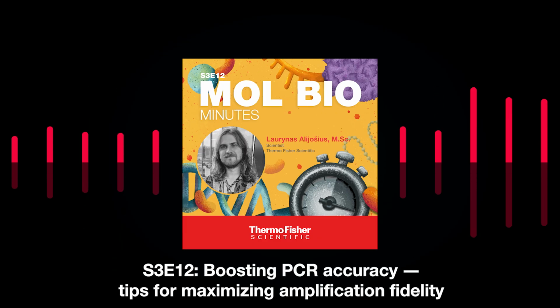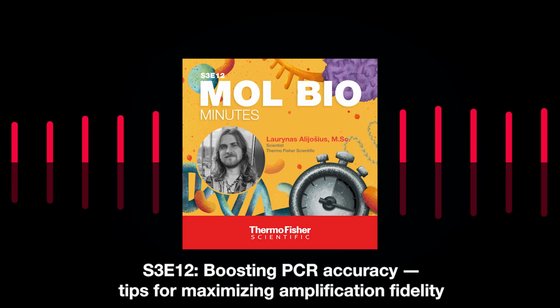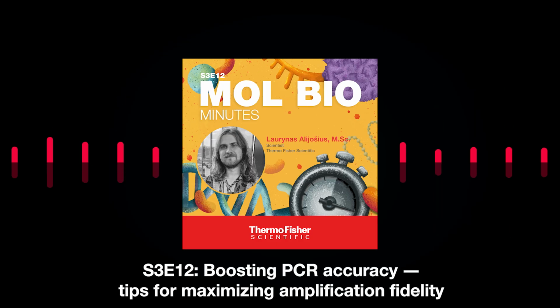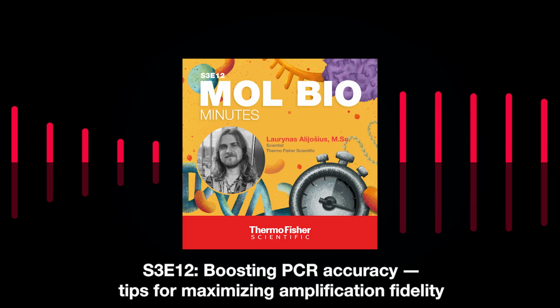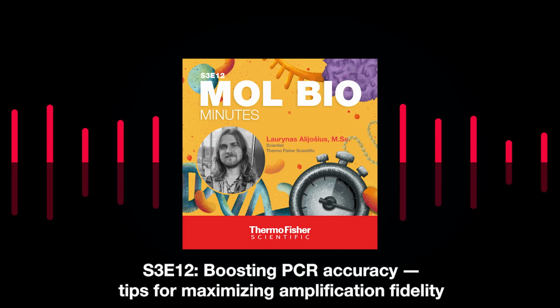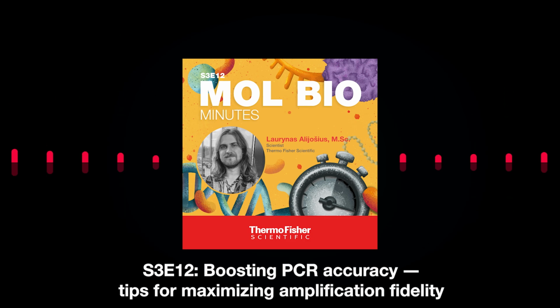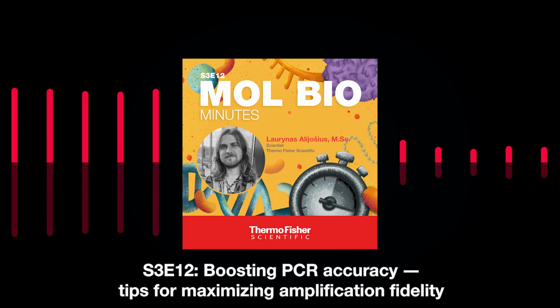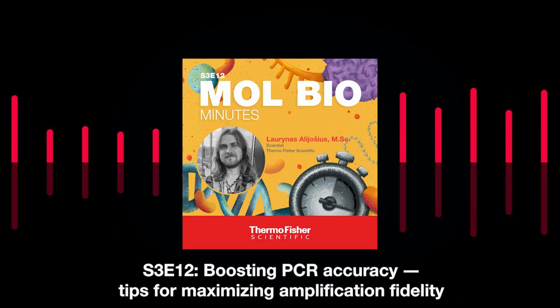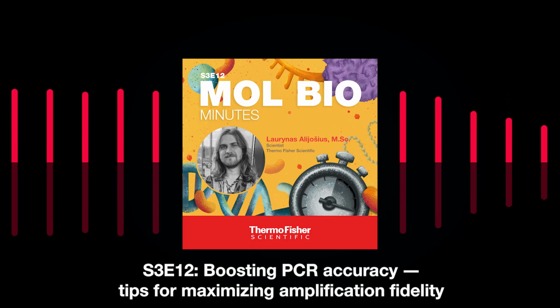Well, you can change that simply by changing the polymerase that you use for your PCR reaction. So, for example, you could change Taq DNA polymerase to an advanced polymerase, let's say Platinum SuperFi DNA polymerase, which is excellent, high fidelity, and is more than 300 times more precise than the conventional Taq polymerase. The difference here is huge.